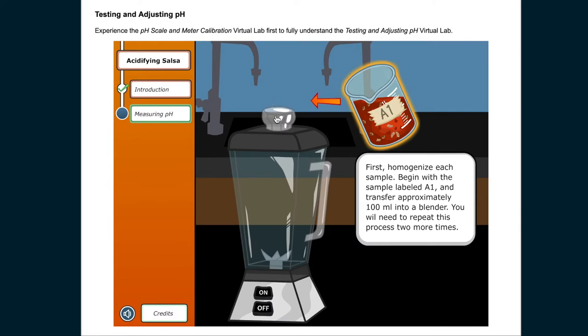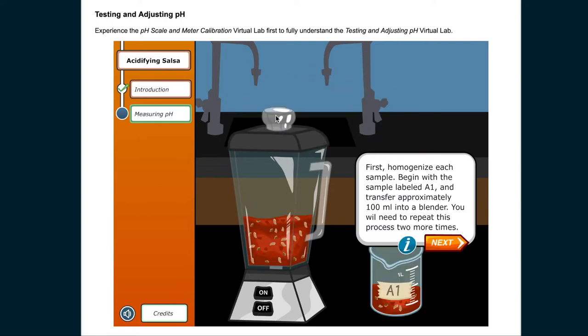First, homogenize each sample. Begin with the sample labeled A1 and transfer approximately 100 milliliters into a blender. You will need to repeat this process 2 more times.